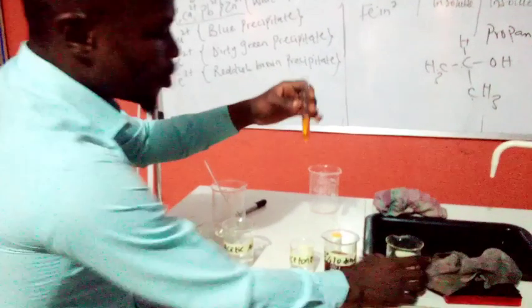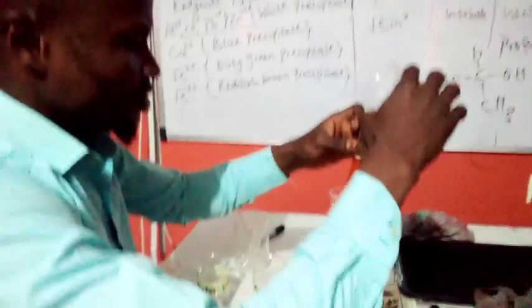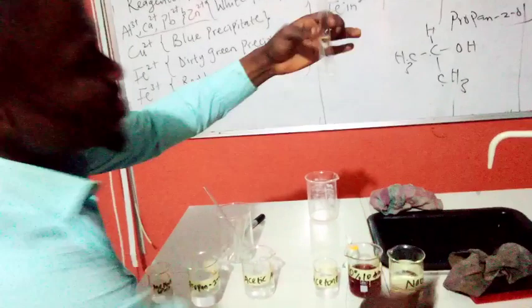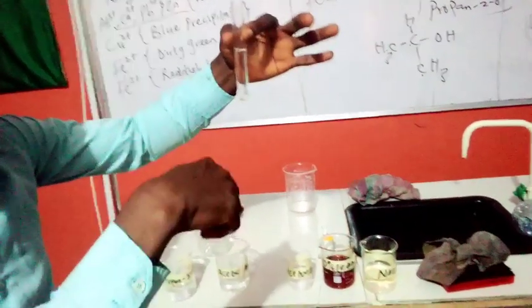Good. Then I'm going to add my sodium hydroxide. Wow. This is a negative test. As you can see, it is completely decolorized. It is a negative test.